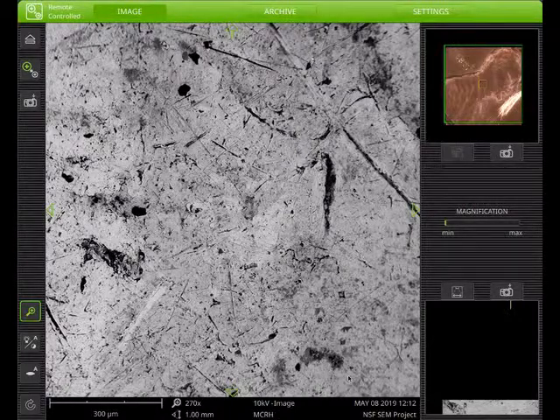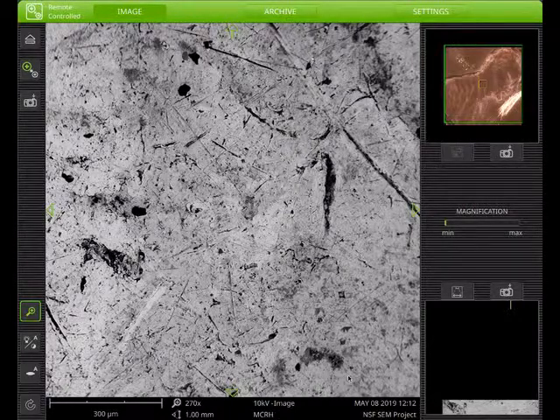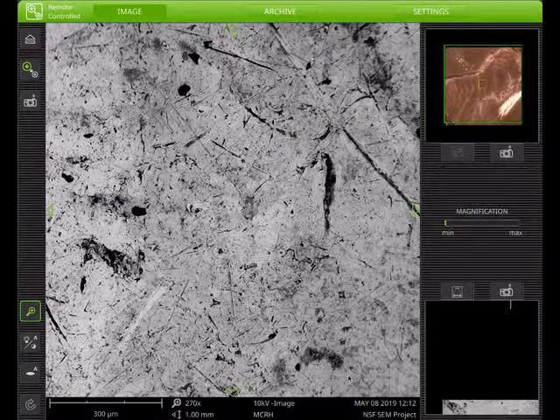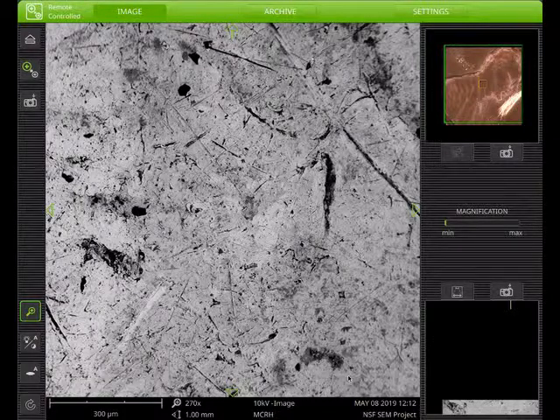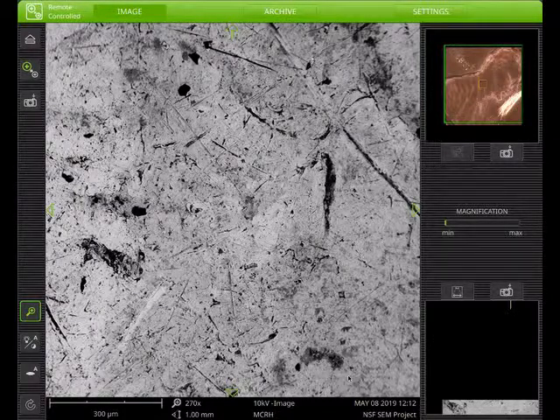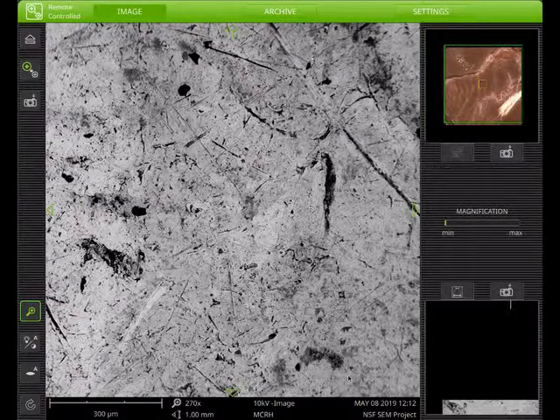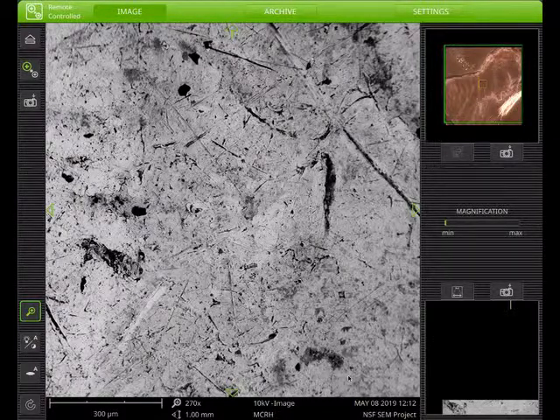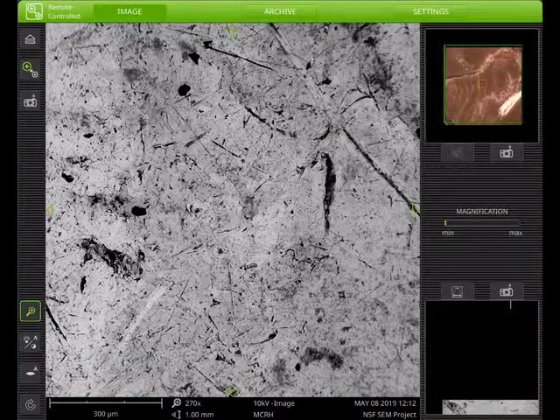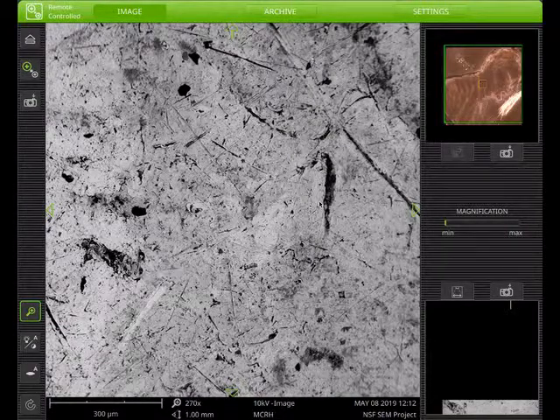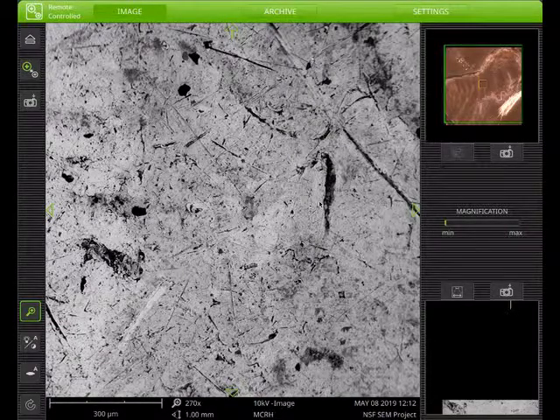Again, in a minute we're going to look at how we would do a chemical analysis on the surface, but right now we're using the backscattered electron detector to give us a sense that there are different chemical compositions on the surface of this penny.